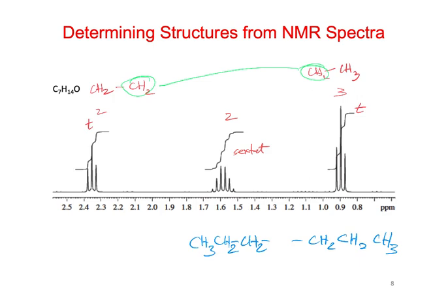Right, so to come up with a molecular formula, because we have 6, we have 1 more carbon, we have to have really a carbonyl in there. So we have a carbon we don't see. The other thing that might help to start out trying to solve a problem like this is being able to calculate out the number of unsaturations. Right? Because if we came up with 1 unsaturation, it would have told us we had a double bond or ring or something in it already.